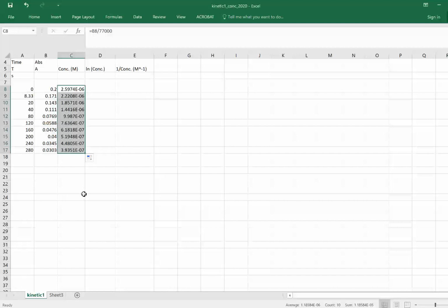I will point out that I have quite a bit less data than what you will see when you're actually doing these calculations, but I chose to have a smaller amount of data so that we can see a little more easily what's involved.